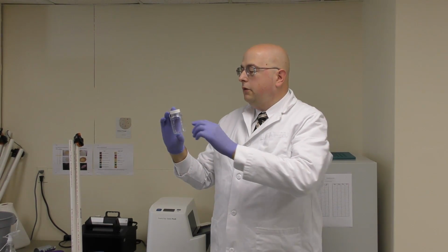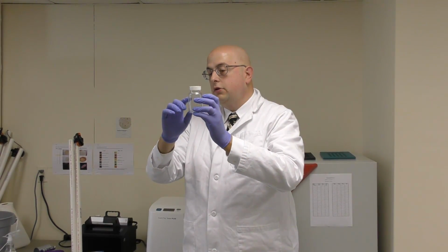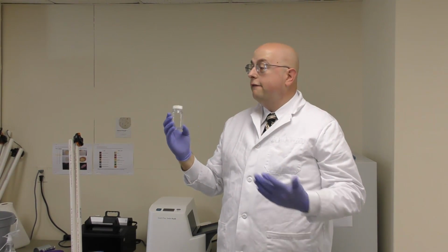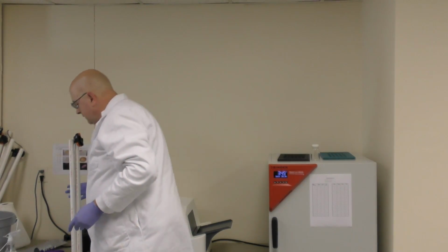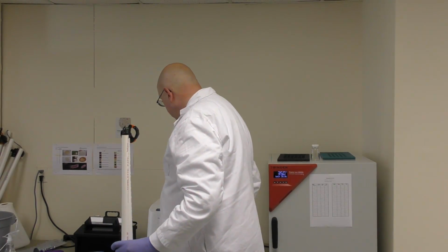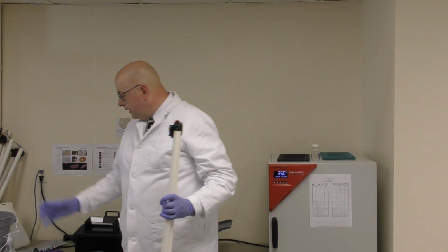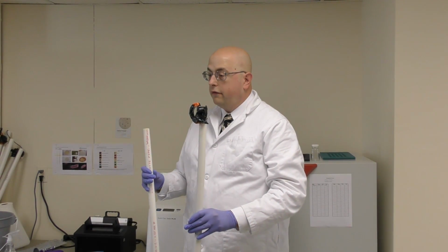When we go out into the field, we'll show it in more detail, but you would fill basically to that 100 milliliter line, and we will actually be testing that full sample volume. So you won't have to worry about any calculations or anything like that. Now, for sampling equipment, you would either collect your sample directly in the bottle itself, like if you're wading into the stream, or you would use something like a sample wand if you're from the stream bank.